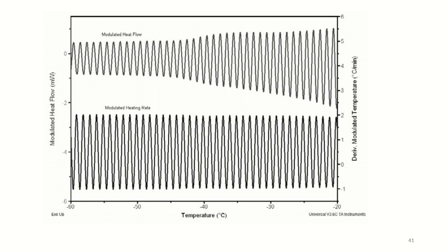This figure actually shows the raw modulated heating rate and modulated heat flow signals from a modulated differential scanning calorimetry experiment.